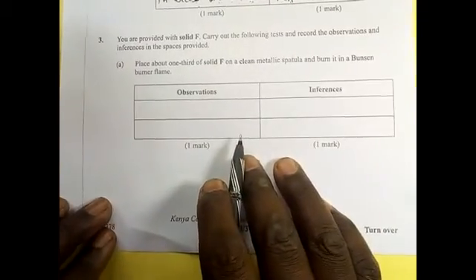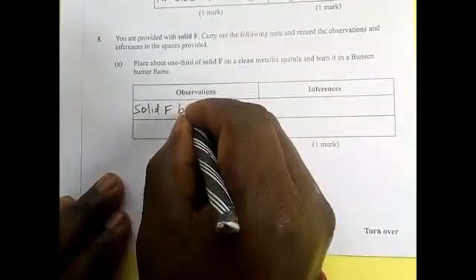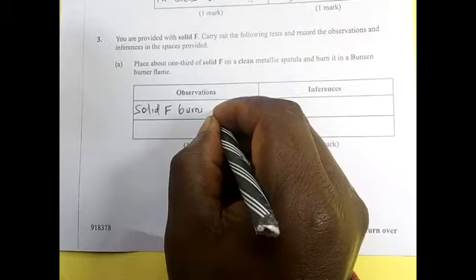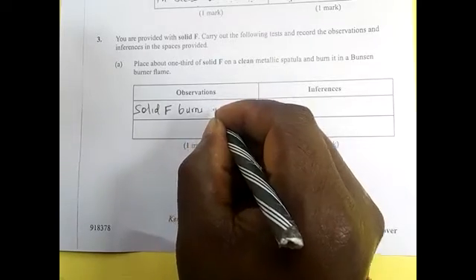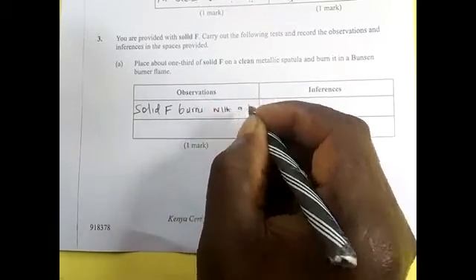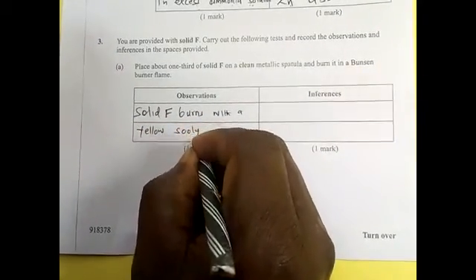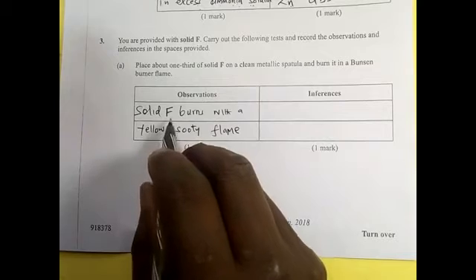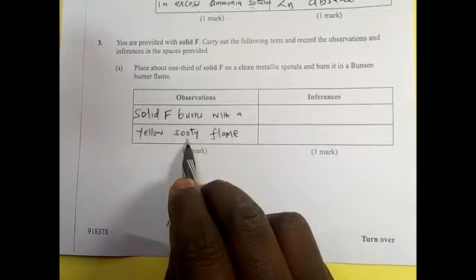So when it was burned, what happened? Solid F burns with a yellow sooty flame. Soot means smoky, the one that produces a lot of smoke.